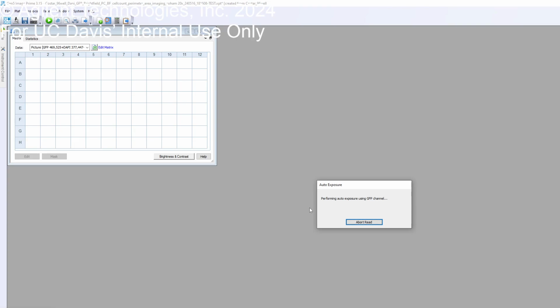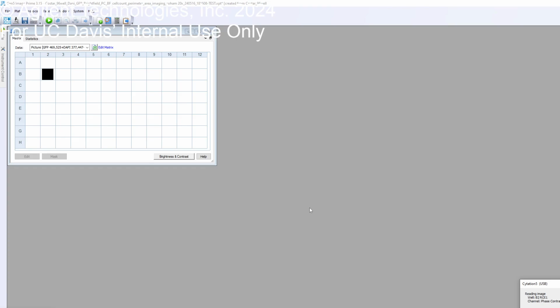So in case you go to higher magnification, you can select 9 spots, but also as a 2x2 montage. Then it goes to those 9 locations and does the montage, and it also applies these stacks. You can do all sorts of stuff. All the functionalities can be layered on top of each other. The data set is going to get larger, it's going to be huge.